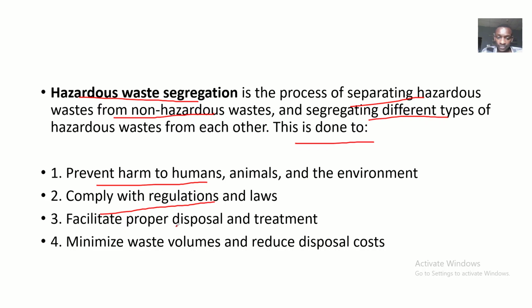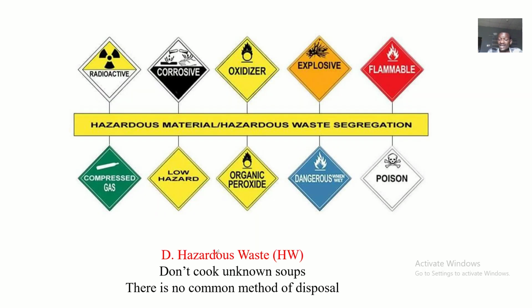It facilitates proper disposal and treatment, minimizes waste volumes, and reduces disposal cost. It is economical to take safety precautions rather than go down with a disaster in the laboratory.